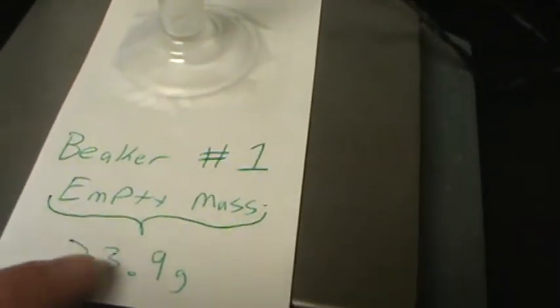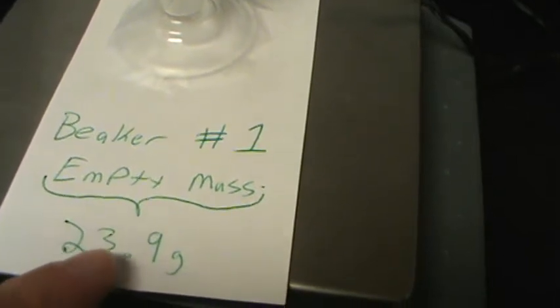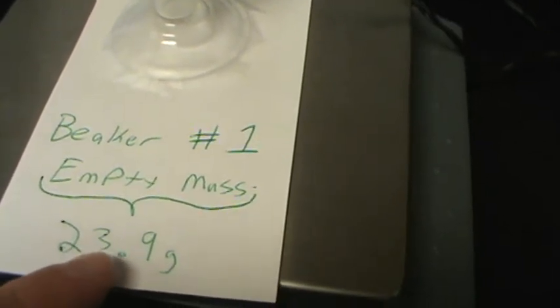Well, if you need density, as you did in part 1, you need a mass and a volume. So what it's going to be is to take this, put it onto the digital balance, not the triple beam balance, and say, oh, okay, so the mass of this now is going to be a number that's higher than 23.9, because it's this stuff and the liquid.